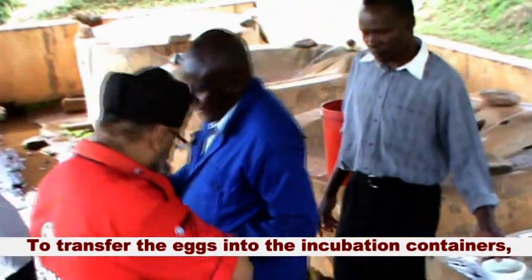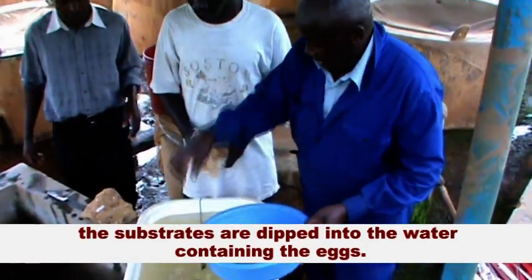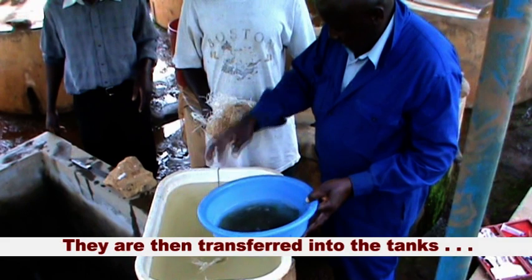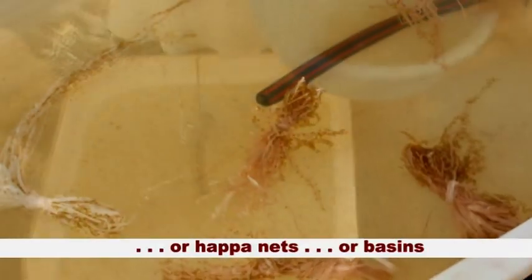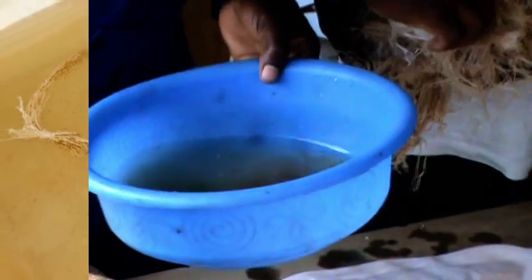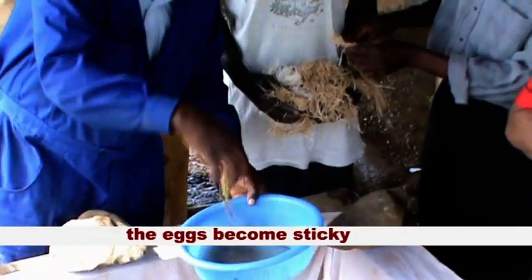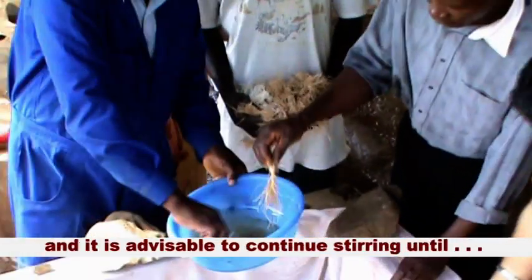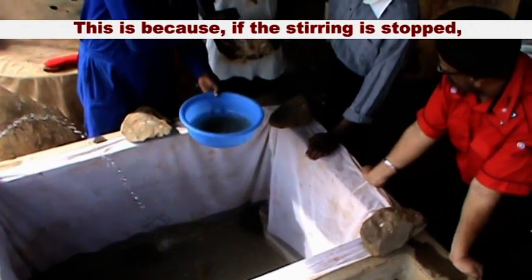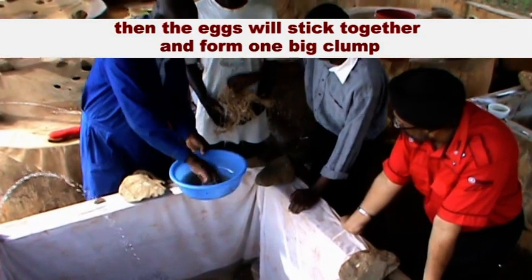To transfer the eggs into the incubation containers, the substrates are dipped into the water containing the eggs and the eggs will stick on these substrates. They are then transferred into the tanks, hapas, or basins, whichever incubation container is available. Once the fertilization has taken place, the eggs become sticky and it is advisable to continue stirring until all the eggs have been put into the hatching tanks. This is because if the stirring is stopped, the eggs will stick together and form one big clump.